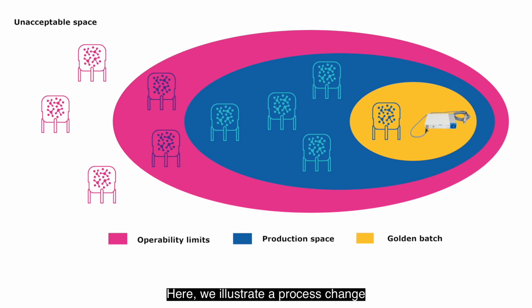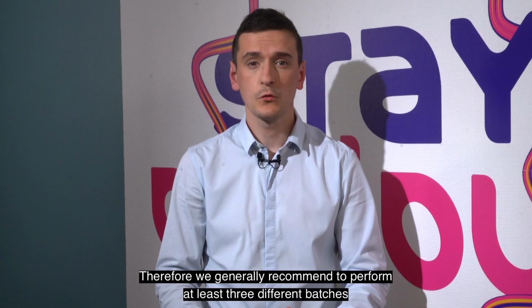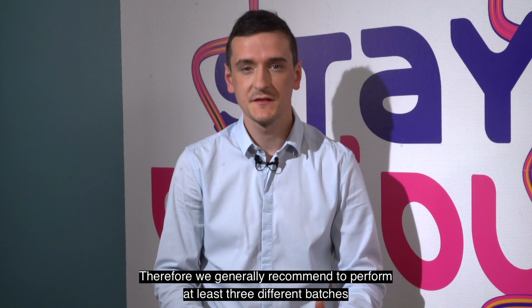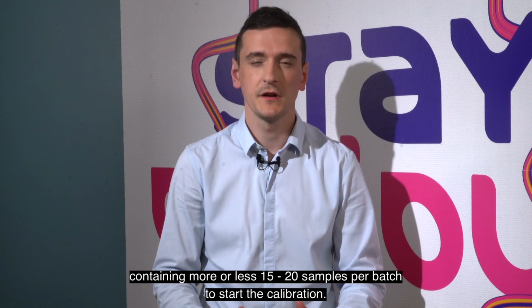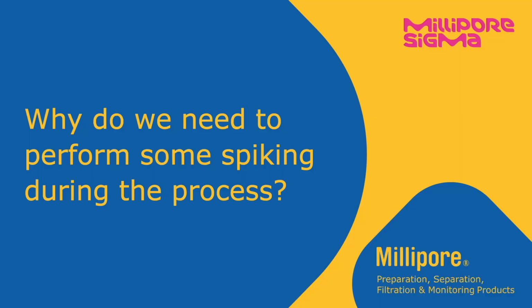Here, we illustrate a process change, meaning that if you try to measure another process with experimental condition outside of the operability limits, then the model will not be able to monitor it with accuracy and consistency. Therefore, we generally recommend to perform at least 3 different batches containing more or less 15-20 samples per batch to start the calibration.